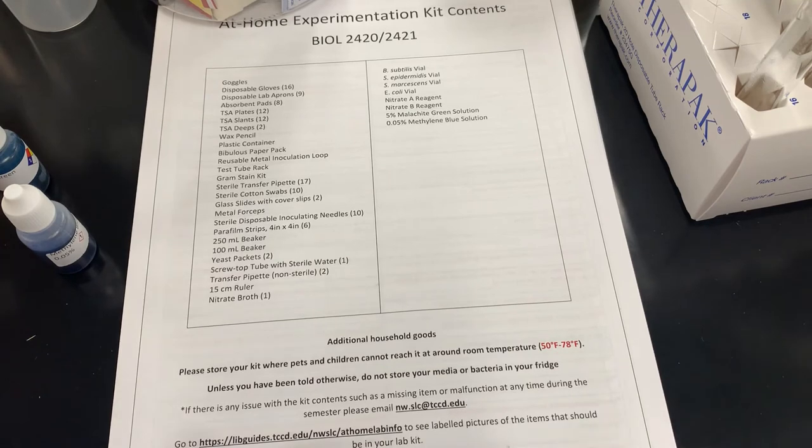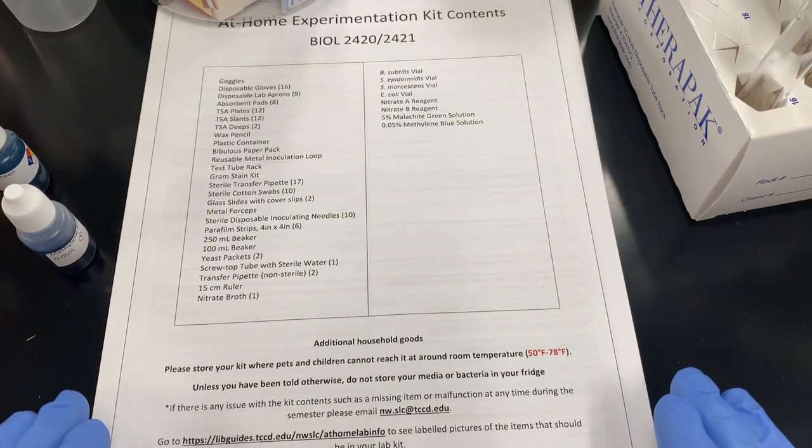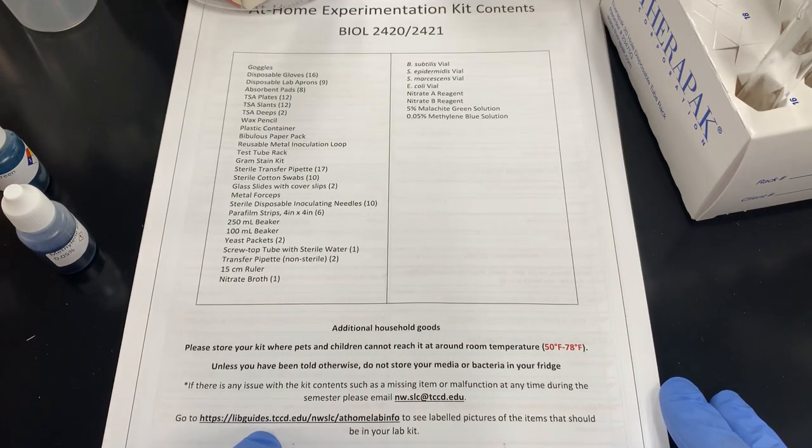On top of this, please store your kit where your pets and children cannot reach it, and also store it around room temperature. You do not need to store this in your fridge. Please check your kit contents when you get home. Thank you very much.